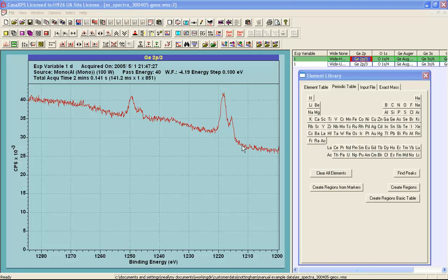And the reason for that is that the background must be calculated based on the noise at either end of the interval about which we're going to create a peak model. And since the precision with which we can specify the peak depends on the background definition, and the peak model is constructed from a set of components that sit on top of a background, the background will also alter the relationship between peaks within a peak model.